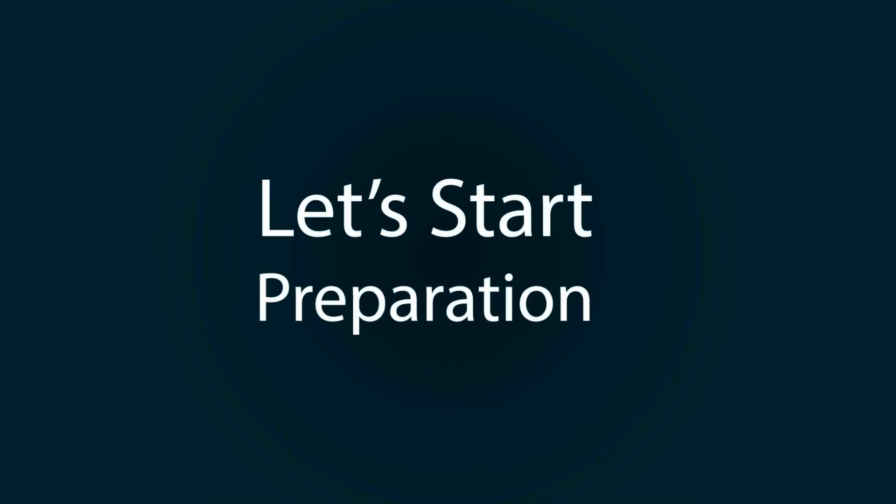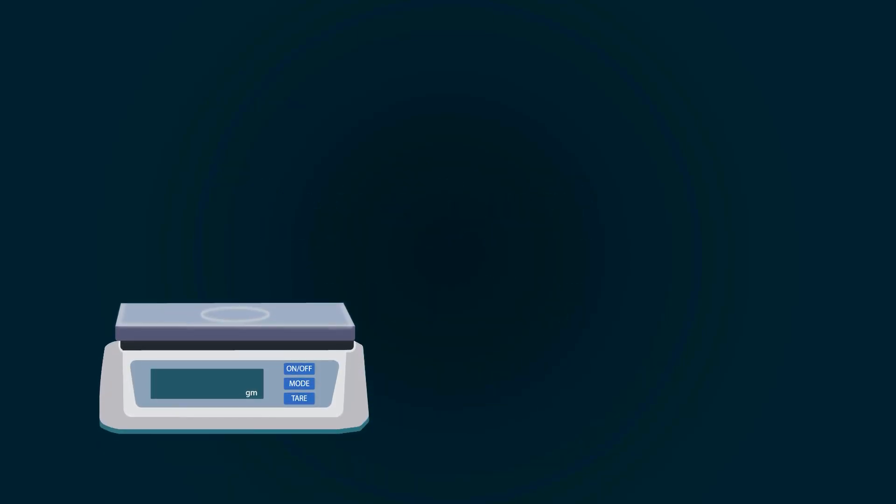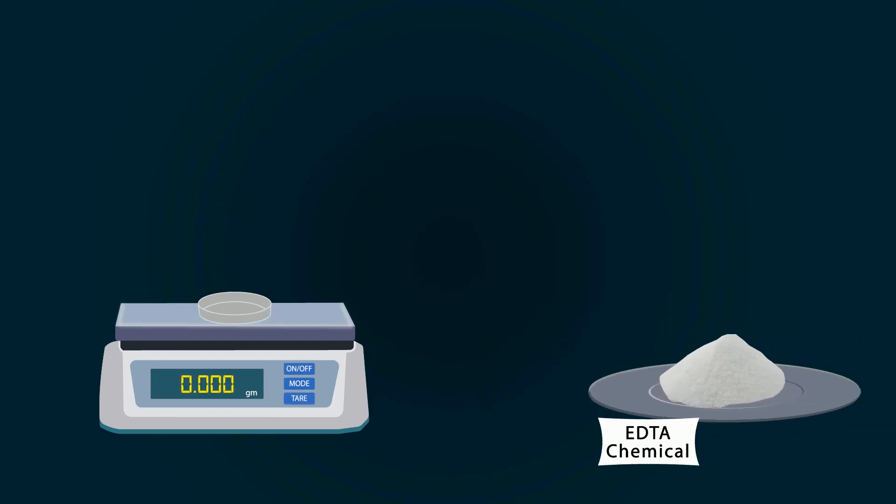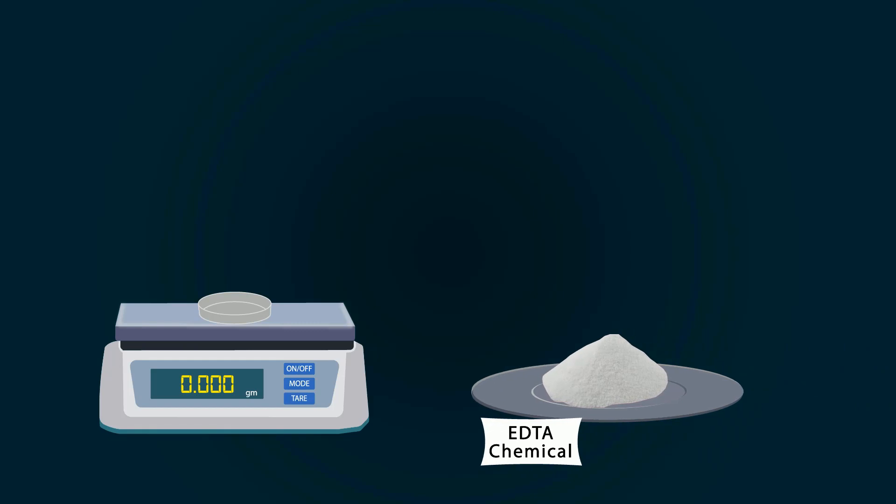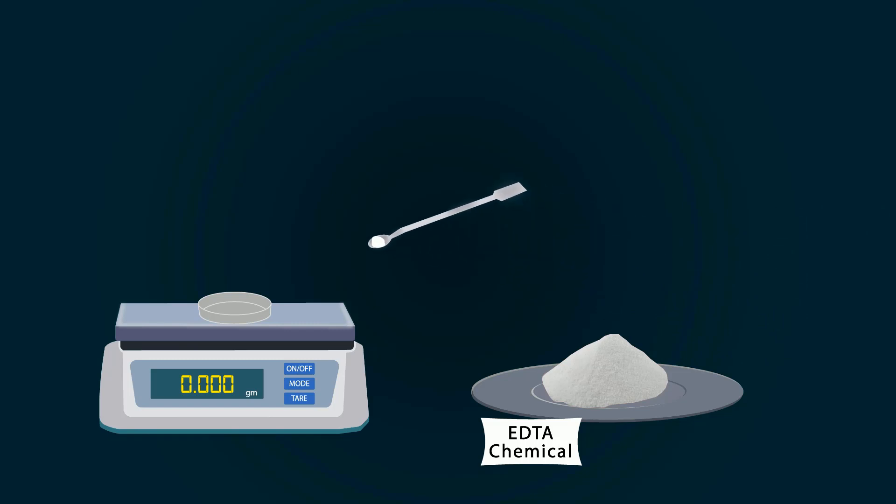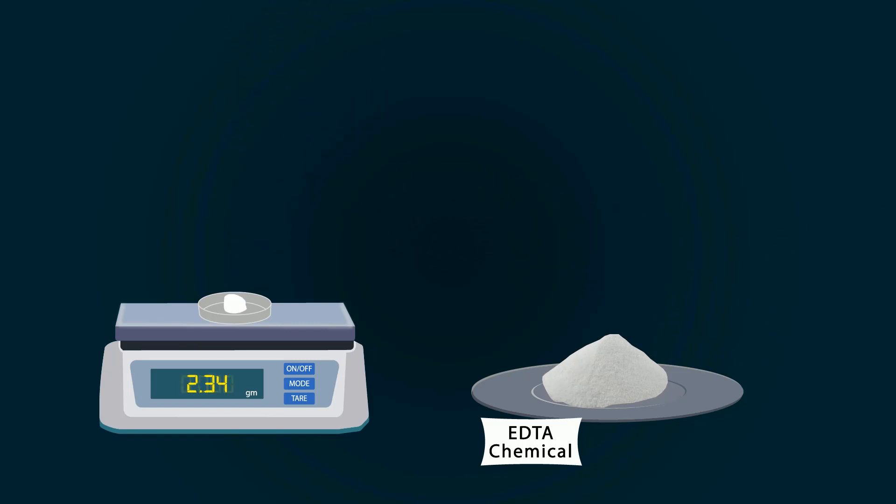Let's start preparation. First of all, take a weight balance, power it on, put a petri dish on it, and don't forget to tare it. Now take EDTA chemical. You can put EDTA chemical into the petri dish with the help of a spatula. Weigh precisely 2.34 grams.